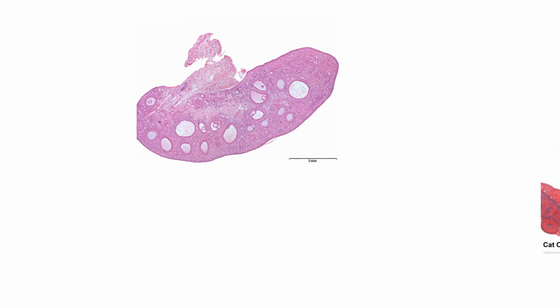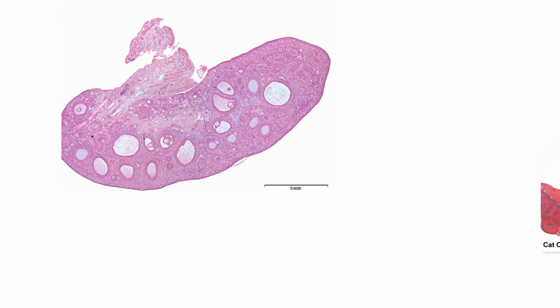Okay, now we're ready for histology, the study of tissue, usually under the light microscope. I mean, there's all kinds of microscopes, and light microscopes basically go from 10x magnification up to 1,000, something like that. Maybe some people would say between 100 and 1,000. Depends on your scope and whatever. But I've got a couple of beautiful pictures that I found. I wish that people would have left their names on them, but it's back in my illustration list.